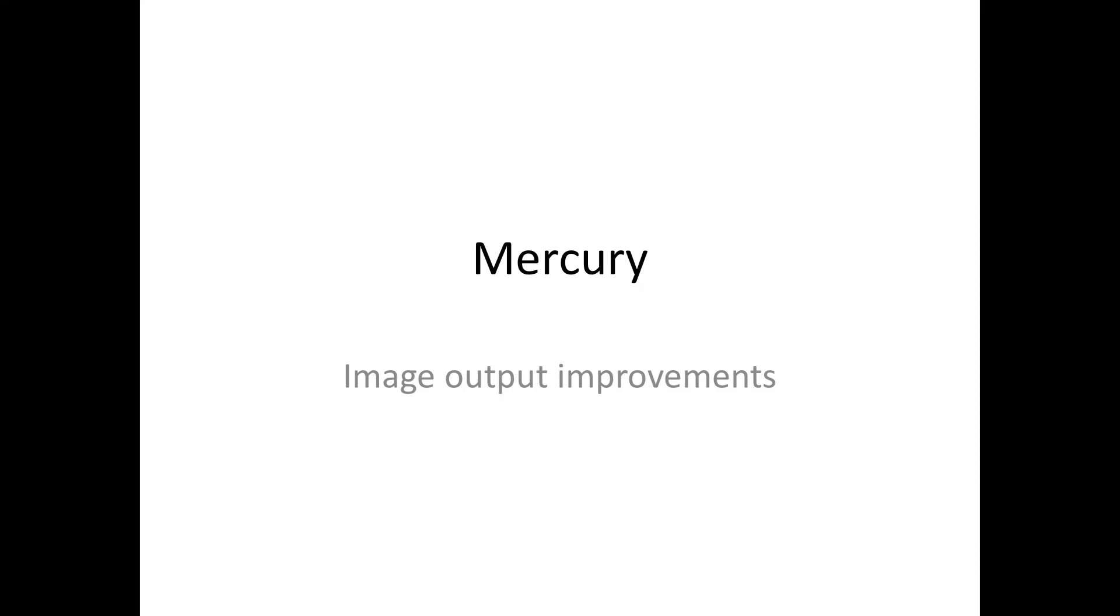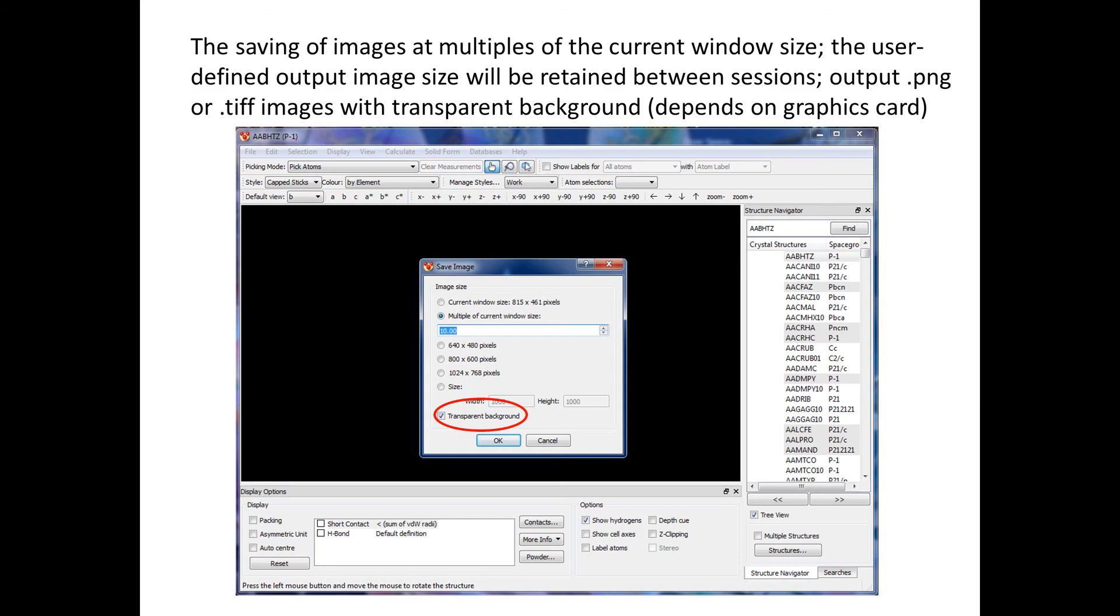Mercury image output improvements. The saving of images at multiples of the current window size. Now it is possible to do this via the save image option. There are different sizes that can be chosen, including multiple of current window size—you can go up to 10 times. There is also the option to output images with a transparent background.